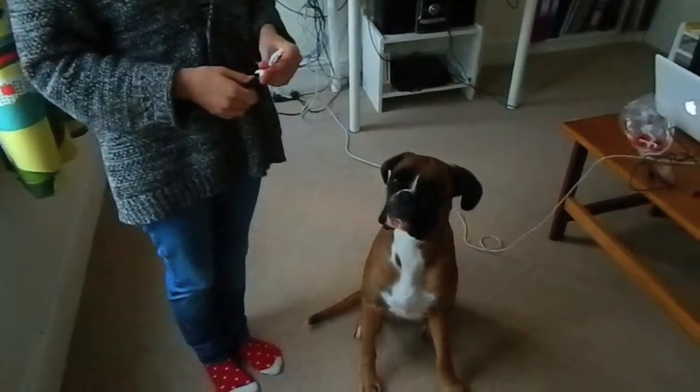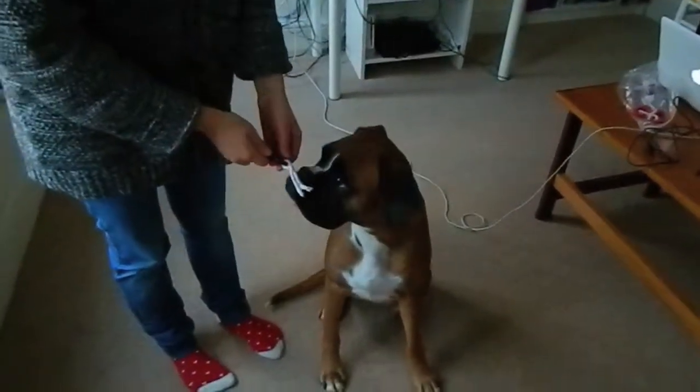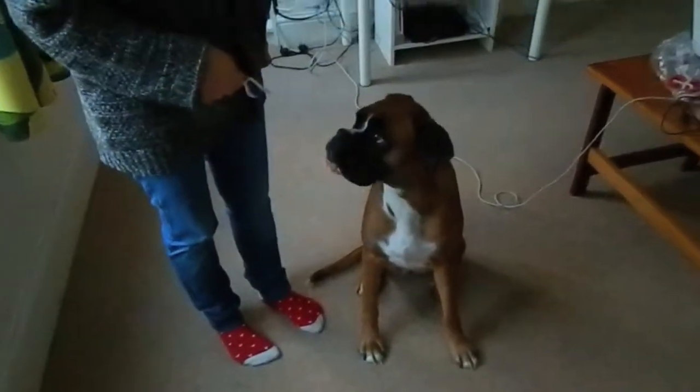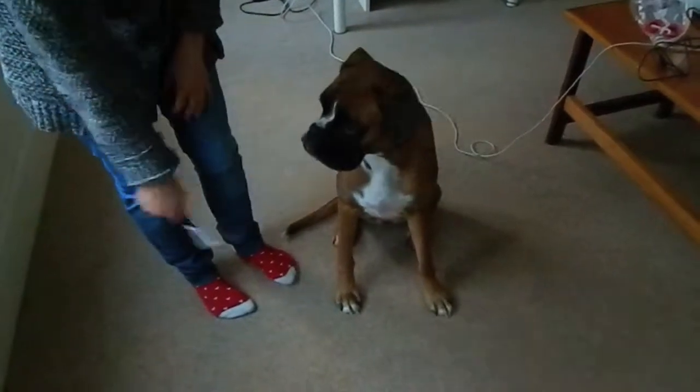Make sure that your dog hasn't eaten anything for at least an hour before you take the sample. Then encourage your dog to chew on the rope. You can maybe move it around a little bit.